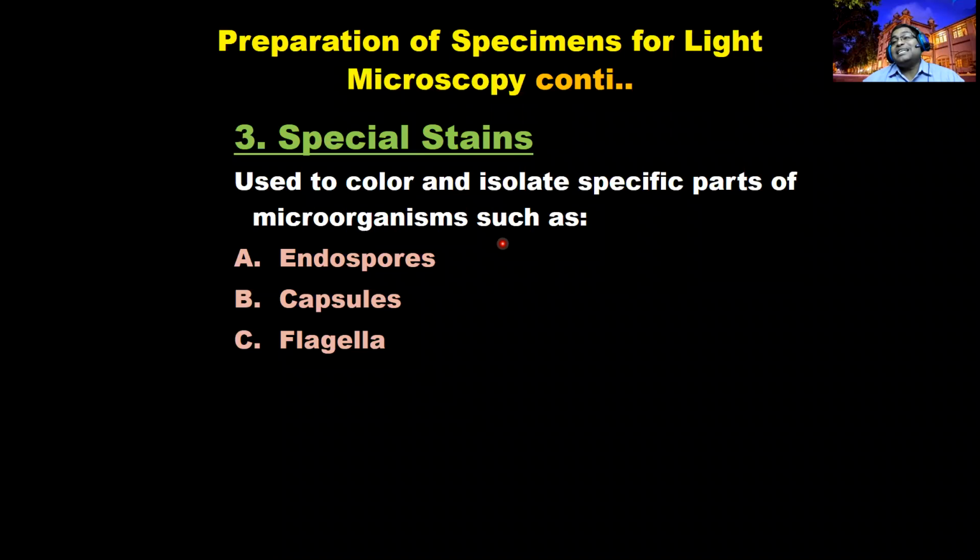These special stains differentiate certain structures present in bacteria, for example the endospore. An endospore means an individual bacterial cell is modified into a spore, especially in gram-positive bacilli. During reproduction, the cells form spores, which we call endospores, a reproductive unit from which bacteria arise.